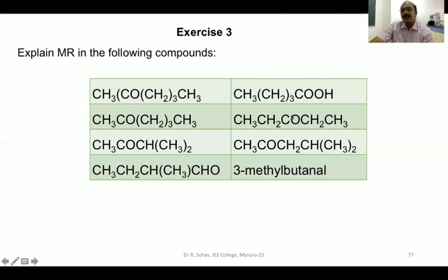In this case, we have to be very, very careful. All the compounds will not show McLafferty rearrangement. For example, this is the carbonyl group. On either side of that, there is an ethyl group. Ethyl has got only 2 carbons, but the prerequisite for McLafferty is it should have 3 carbon atoms. There are no 3 carbon atoms, so this compound fails to show McLafferty rearrangement.